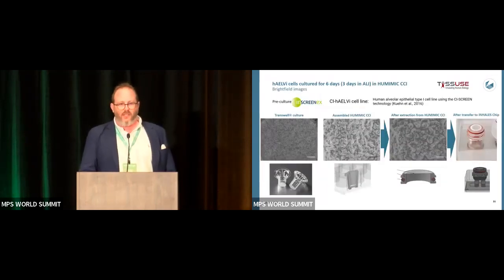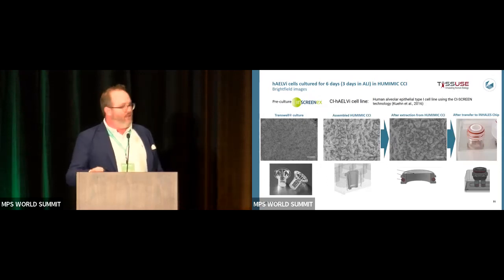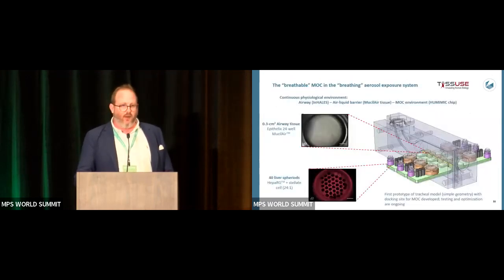And here you can see our first cell cultures compared to transwell cultures. You see here on the first slide the assembled HUMIMIC chip in the holder, and then, after extraction from this holder, it is assembled on the inhales chip. The next step is then to have the breathable multi-organ chip in the breathable aerosol exposure chip system, and have everything combined in one.